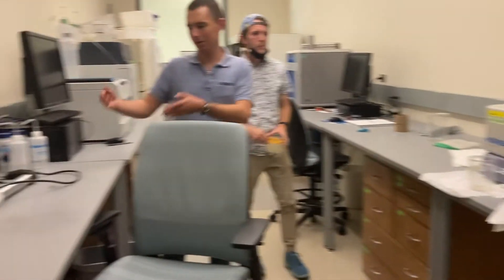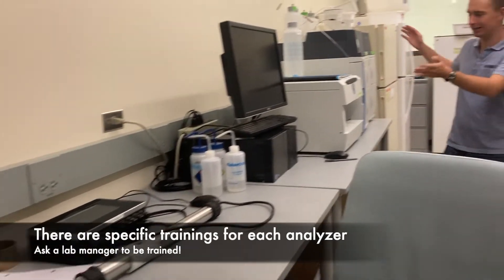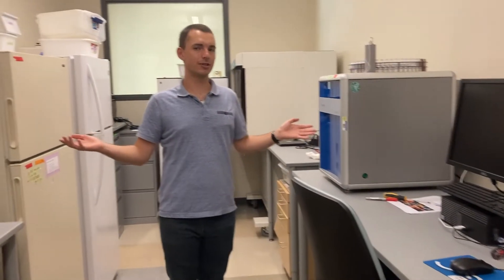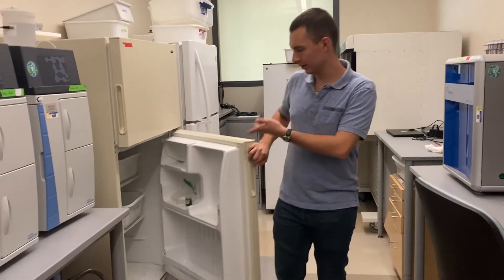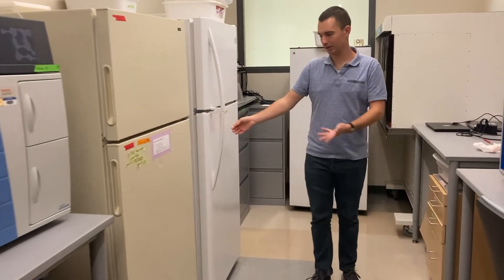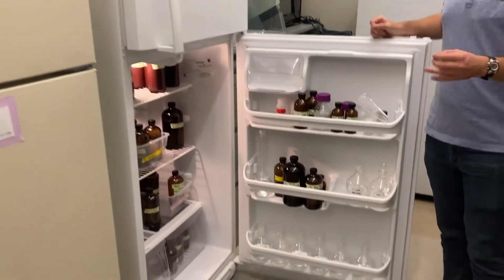In addition to our Aqualog, we have our Scan, we have our IC system, and we have our TOC. All these analyzers measure different things, and once you get trained on them, you'll learn better what they do. Samples are often kept in this fridge or frozen. The second refrigerator keeps standards or chemicals that help us maintain the machines.